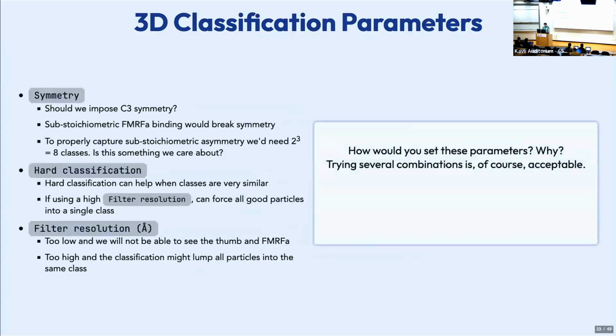I know it's 2 in a row, but I think this will be fun. How would you set these parameters? What do you think you would do? What would be your first job or jobs that you'd set up thinking about these problems?